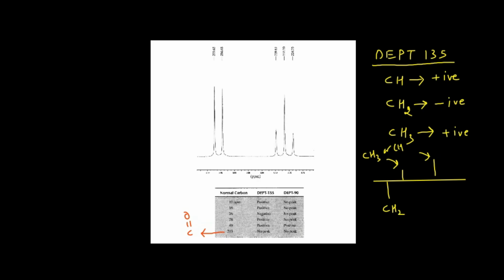This is the information we get from DEPT 135 NMR. So you can see here 4 positive peaks in the DEPT 135.